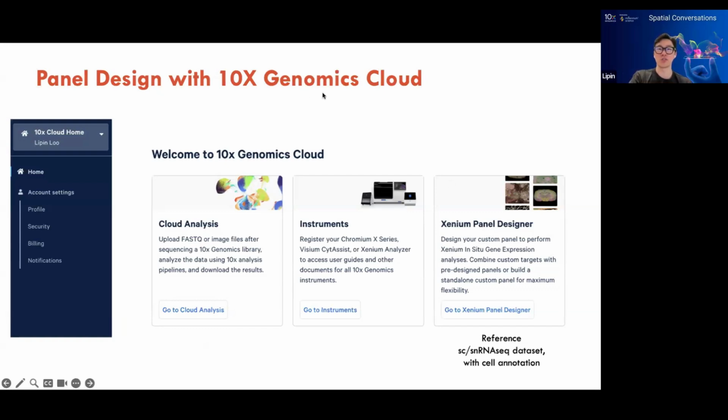You just go to the 10x Genomics Cloud. They have a website now. You create an account. Just showing a screenshot here that I pulled from the cloud. You go into the panel designer, and some requirements for making your own panel include having a reference data set. So in my case, because I had my single nucleus RNA-seq data, I would use that and the cell annotation attached to that data set to develop or build my own panel.